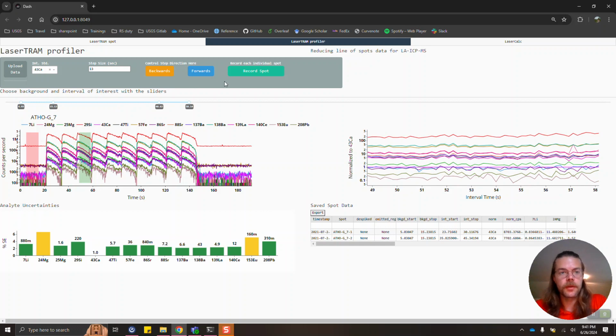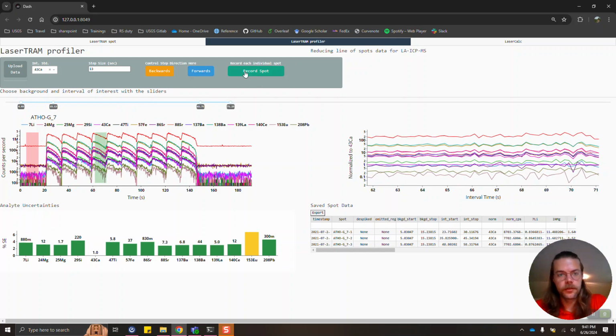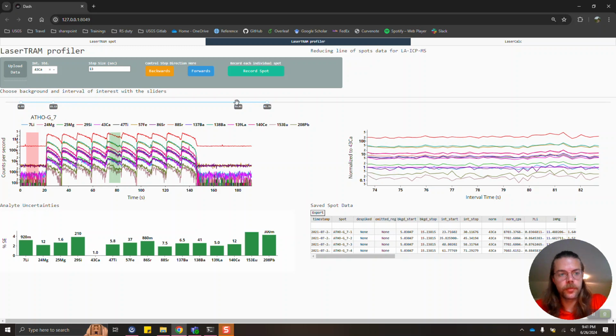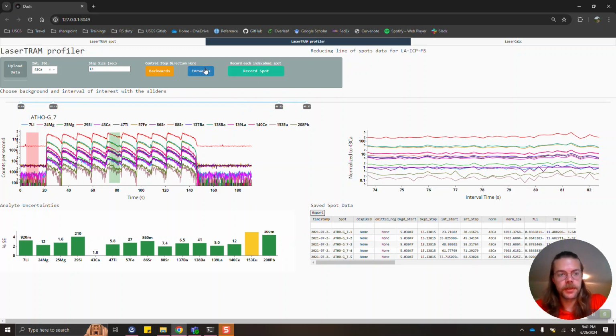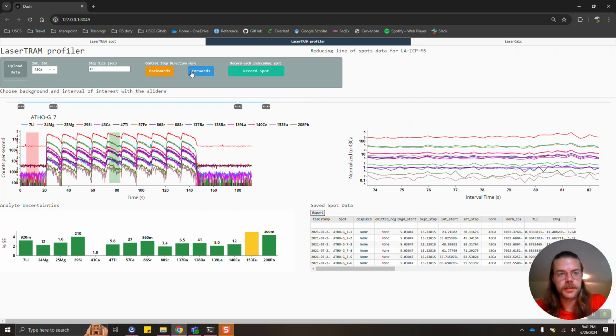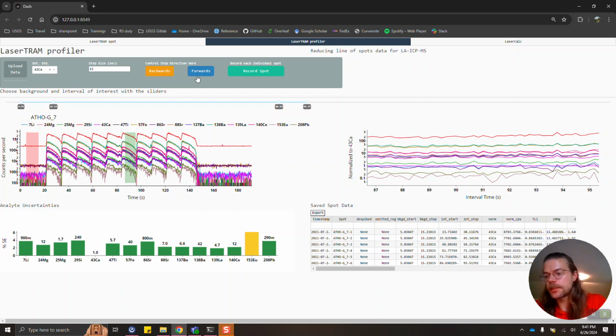And so we hop forward like that, record, hop forward like that, record. That one gets a little bit too far forward. We can adjust our profile back a little bit. It's never going to be exact, but we can record that, and we can keep hopping down the line, recording and going backwards, etc. So this is going to give us the ability to navigate through here in a relatively easy fashion while still giving us the time resolved control that we would like.